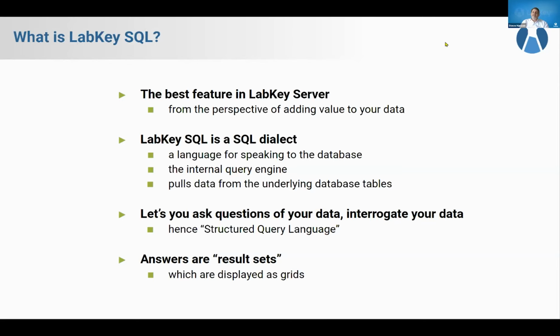It's also a SQL dialect. It's a way of speaking this language, the language of databases. SQL is a whole family of different dialects, but they all speak to databases. They all pull data out of databases. And this is just our internal version of it, the one we also present to users, giving you a chance to pull the levers and write SQL in LabKey SQL.